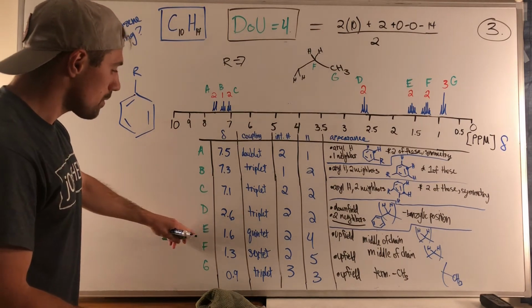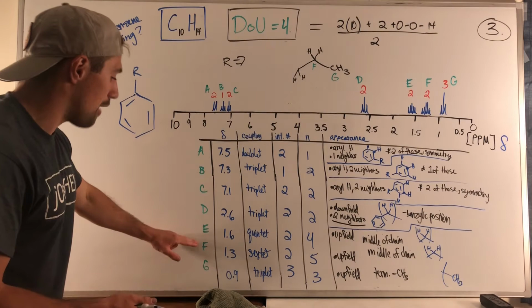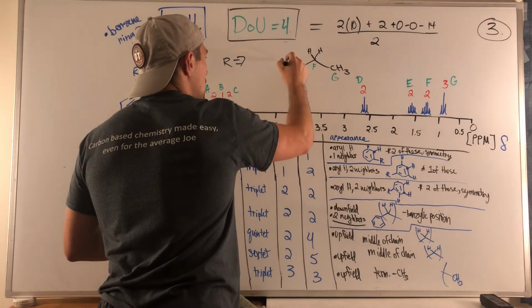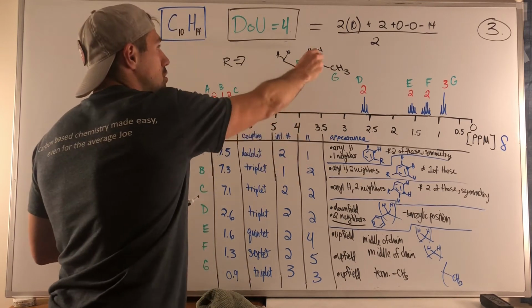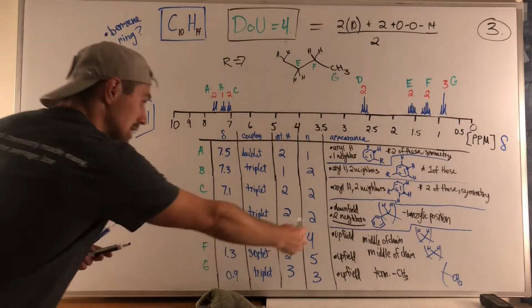E, we're getting more upfield. Or sorry, more downfield, right? As we go from G, F, E, and D. So E is a quintet. So if we just, again, further the chain, we have 2 neighbors right here. This does satisfy what E is, because 2 neighbors plus the 4 neighbors that E has.